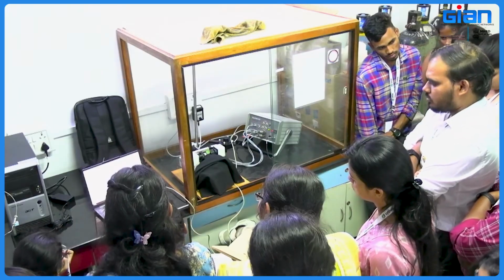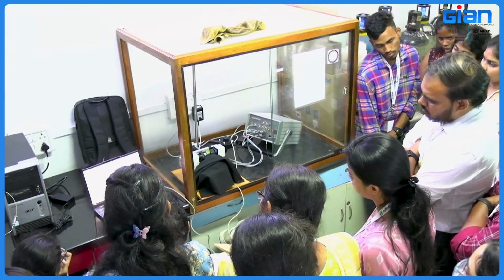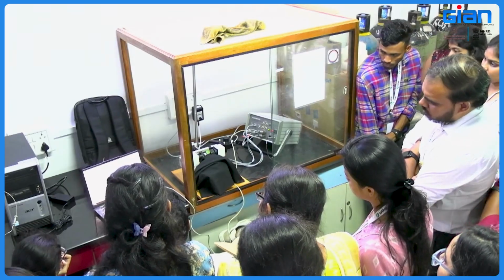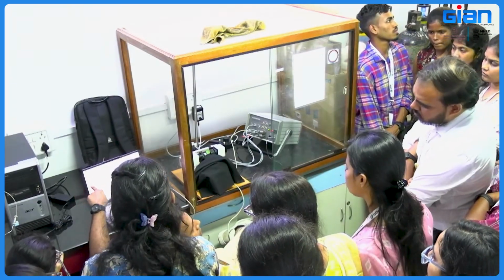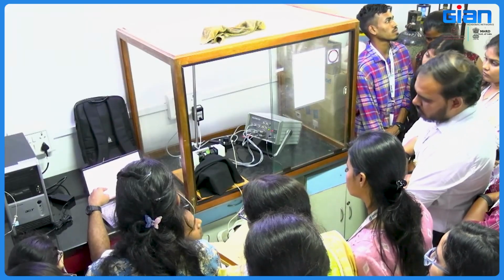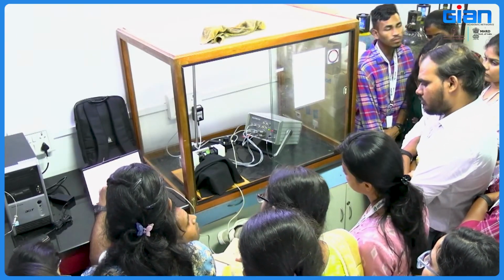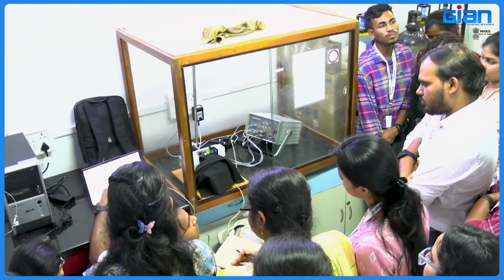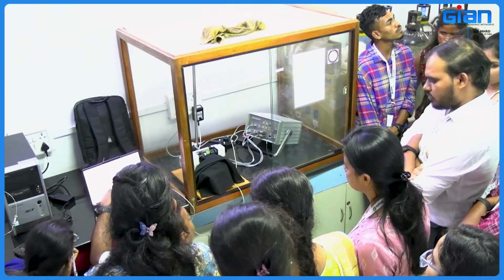So this is your ETR2. And this one is your Y2, the yield of PS2. It is plotted the same way as Y1, and ETR2 the same way as ETR1. Only ETR1 will be higher than ETR2.